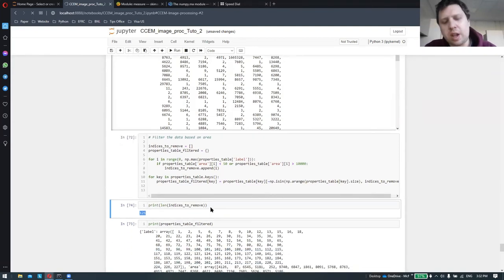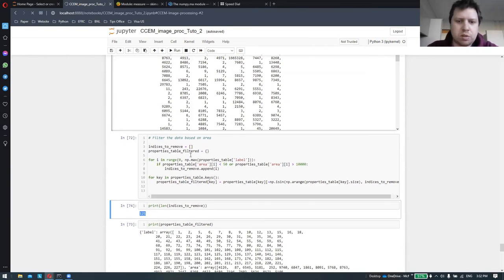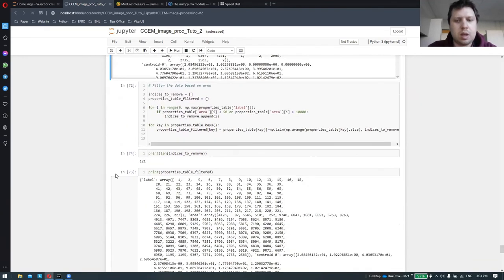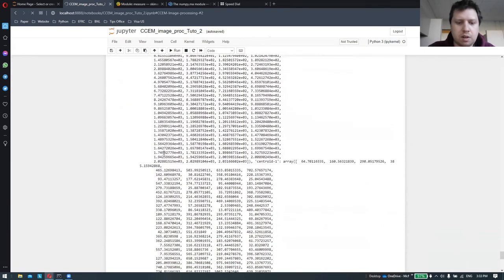That is quite non-negligible. I think this is telling us that something could have been improved regarding the thresholding, especially the ones that are capturing those little particles. I would even say that the blurring phase could have been a little bit stronger to remove those little artifacts. But anyway, you can correct it afterwards in the post-processing.